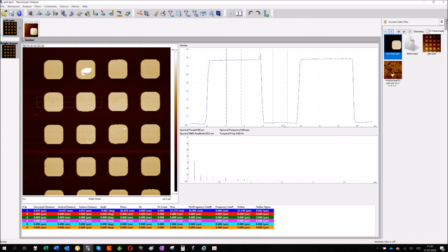So that's about the section. The last point which I didn't explain yet is here the spectra, or generally the fast Fourier transformation of the line spectrum. I will prepare a special video about fast Fourier transformation, so I will talk about it in later videos.